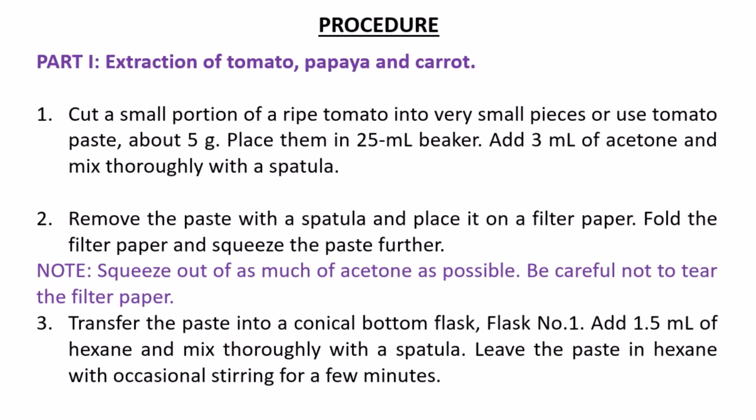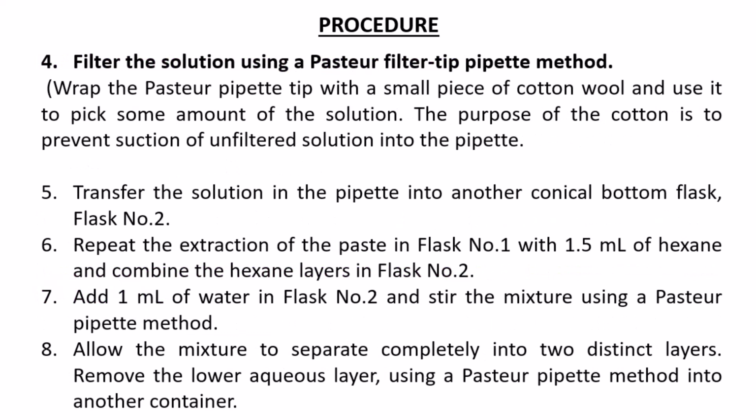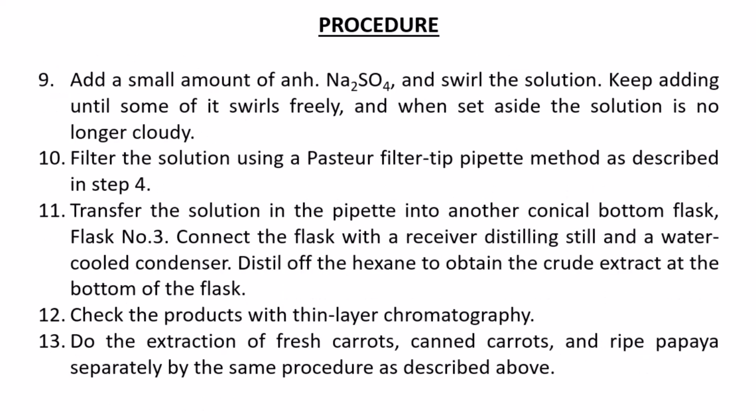You're going to concentrate that extract, and then you do a TLC analysis on the extract to get to know the number of spots present, right? So a different solvent system will be used in the process to remove the desired extract. This is basically everything about the process that you're going to use to get your extract from the papaya, the tomato paste, and then of course the carrot.